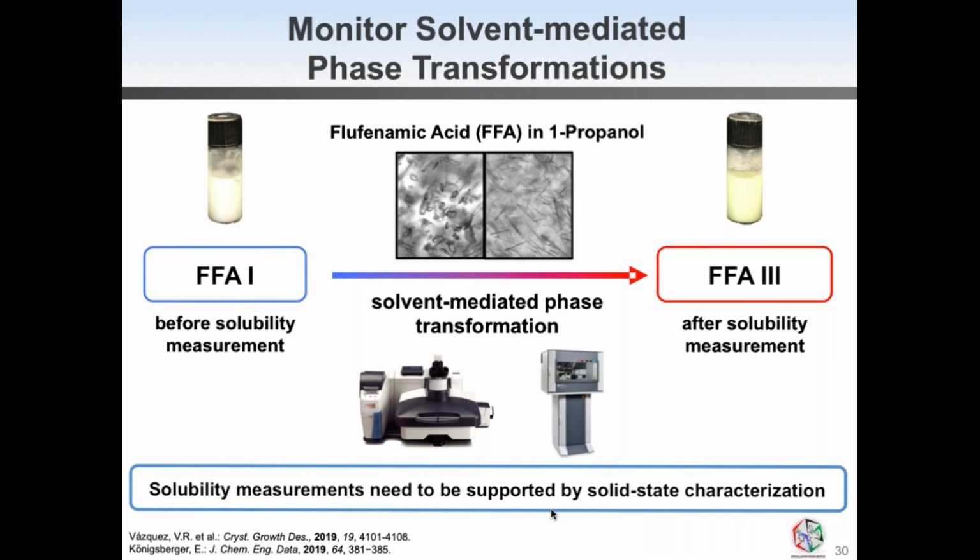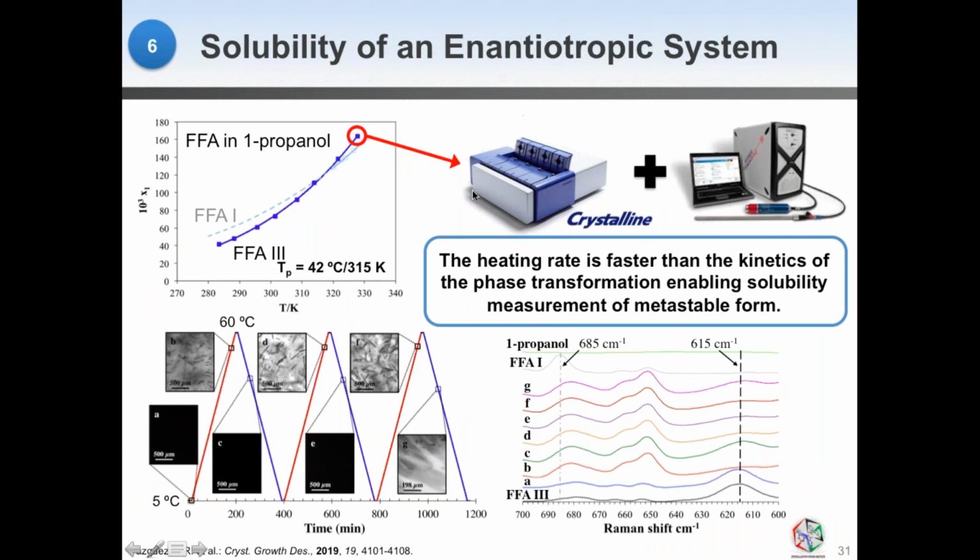However, the crystalline system can also enable in situ solid state characterization by coupling it with Raman spectroscopy, which actually helps us to maybe prevent sampling for offline characterization. Here in particular, we would like to show you an example where we were able to monitor the solubility of flufenamic acid, particularly form 3, in a region at around 60 degrees C, where this form 3 is actually metastable.